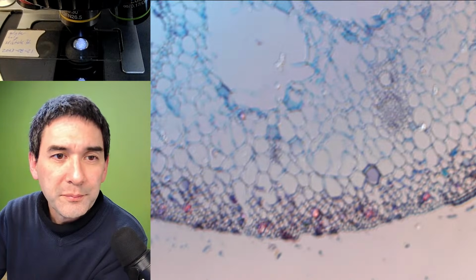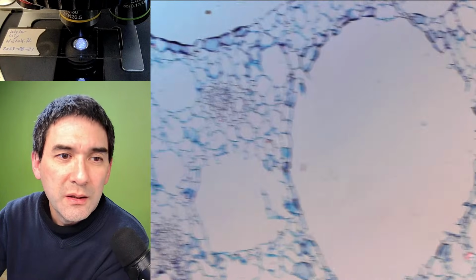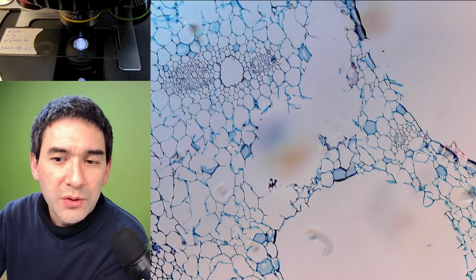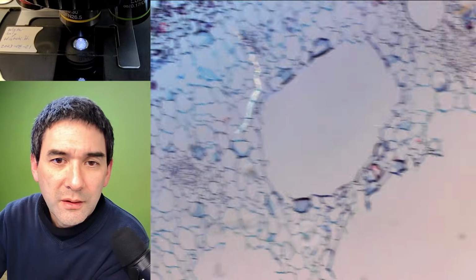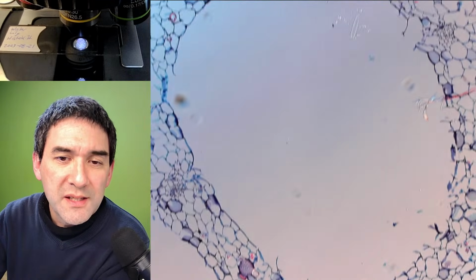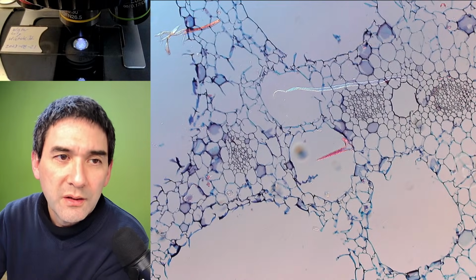Here we go. So he prepared those slides and sent them to me. Let's see if I'm able to find them over here. This one does not seem to have any, because there are these huge air spaces inside. Here is one.